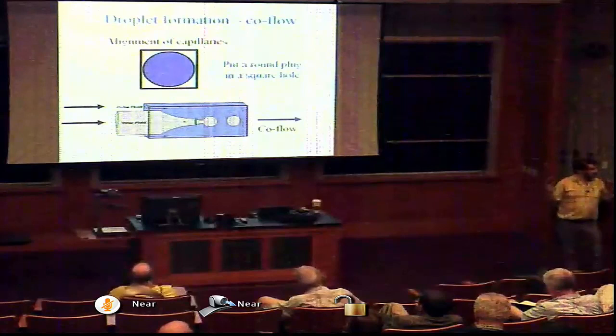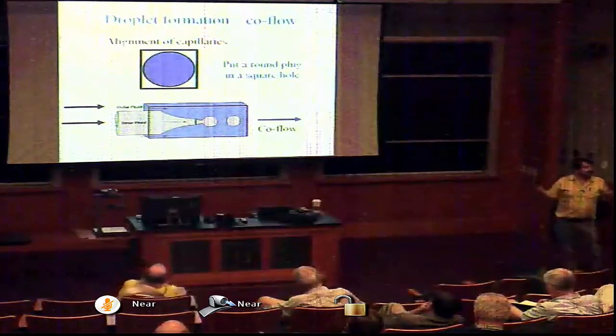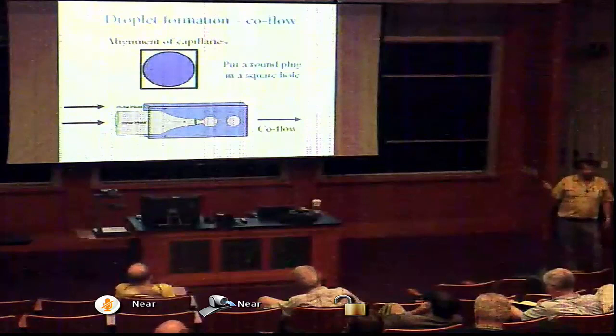You'll see why I want to align them in a minute. And to adjust the flow and create a flow of one fluid into a second. And through that, I can make drops. Here's what it looks like.